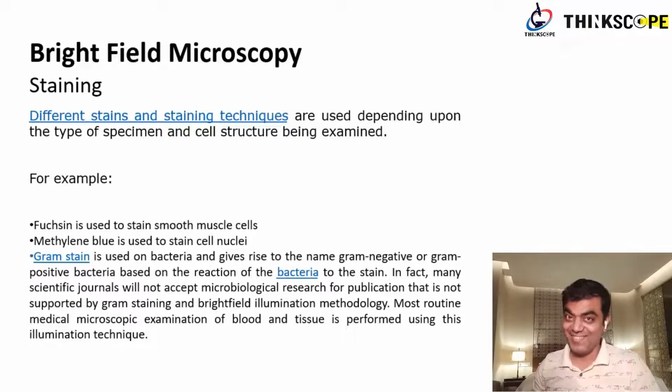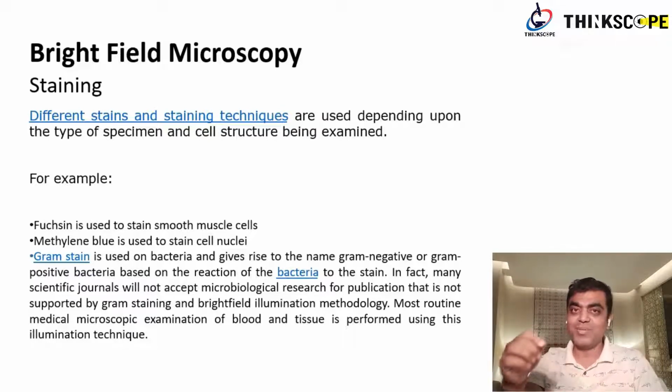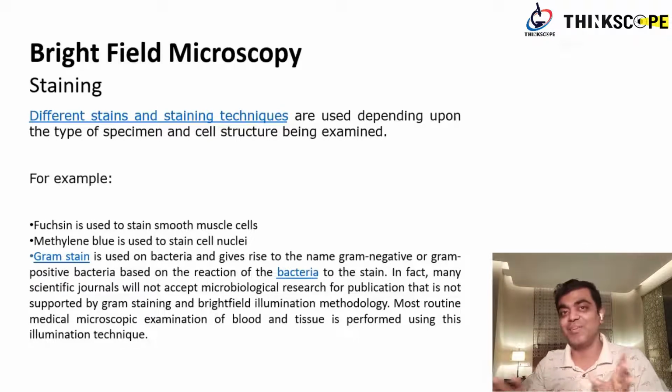Okay, interesting, right? Yes, it is. When you practically do it, I think it will be much more fun. You can do it at home also. You can collect leaves, add some dye, even your blue color dye, like methylene blue and all. This is commonly available. Acridine orange is also very commonly available. Just add a drop of it, then pour some water, rinse it, let it wash, and then you see it against a light, even with a magnifying lens, and you'll see the different colors and it will look beautiful.